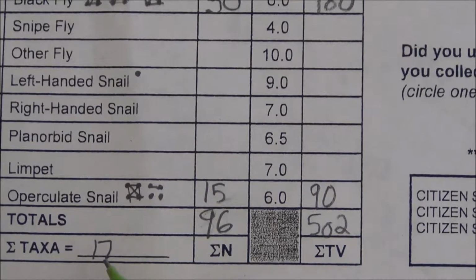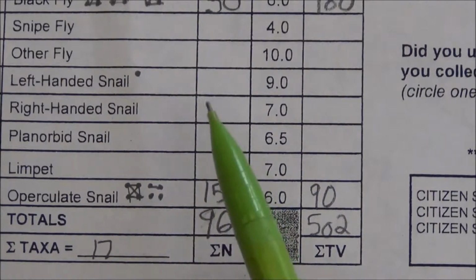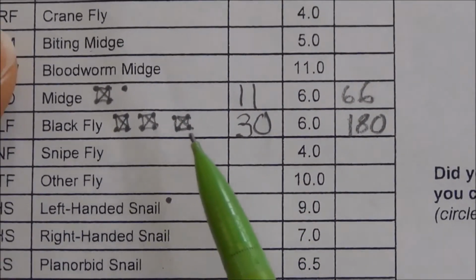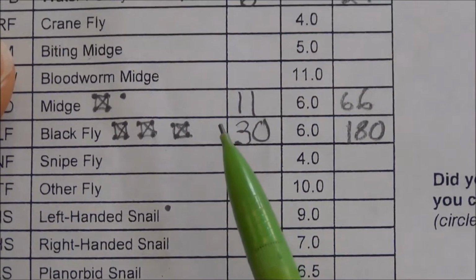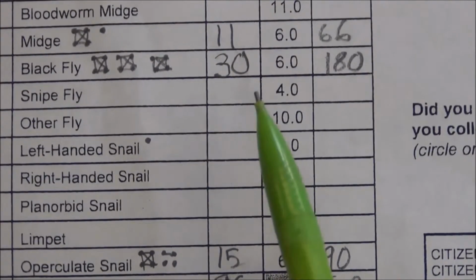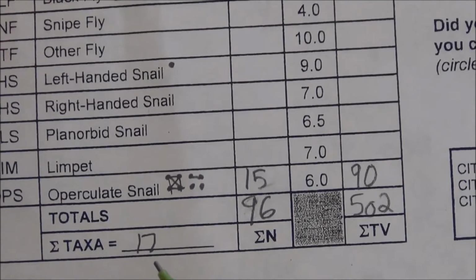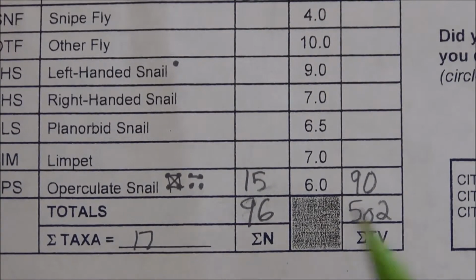Then you also want to record the number of taxa. This is how many different kinds of macroinvertebrates you collected. So you want to count up how many different kinds. A operculate snail counts as 1. Black fly counts as the second, and midge would count as 3. So if that's all you found, your sum of taxa would be 3, but we found much more than that. Your sum of taxa is 17 for this sample.